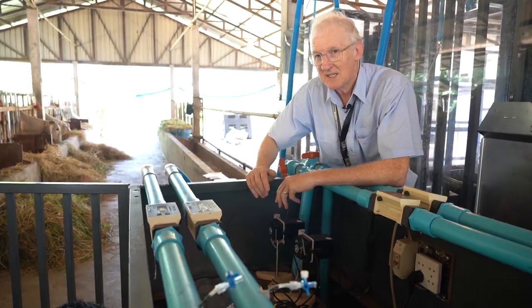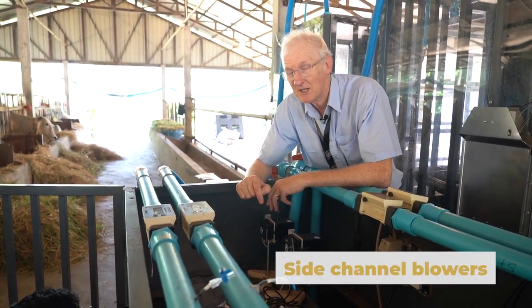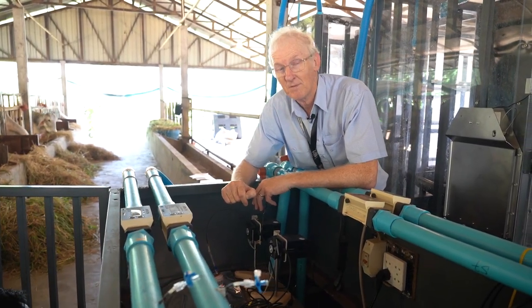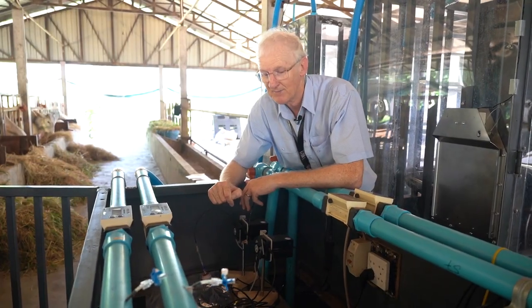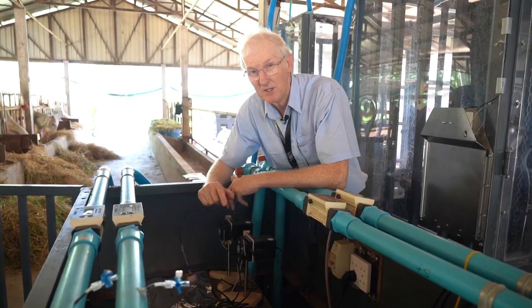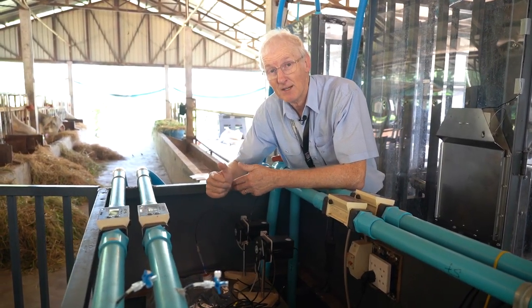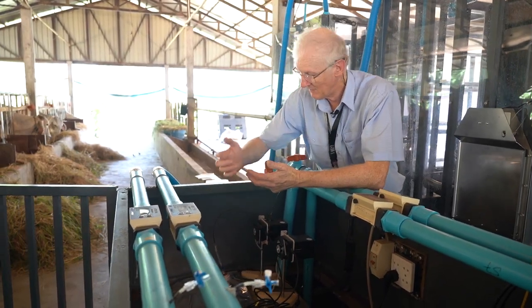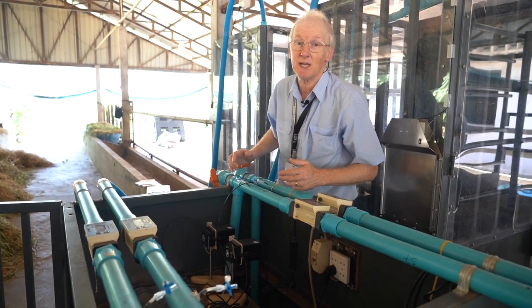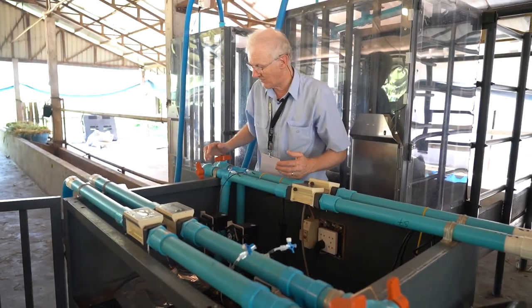Yeah. So these are things called side channel blowers, and they are happy to go continuously for months and months and months without being turned off. So it is no problem for them to run for a week doing an experiment. These side channel blowers, if I was buying them again, I would buy ones that could pull maybe 1 cubic meter per minute for a cattle study. We don't want that high, but sometimes it is helpful in say highly humid situations to be able to increase the airflow to reduce the humidity inside the chamber for the cow.